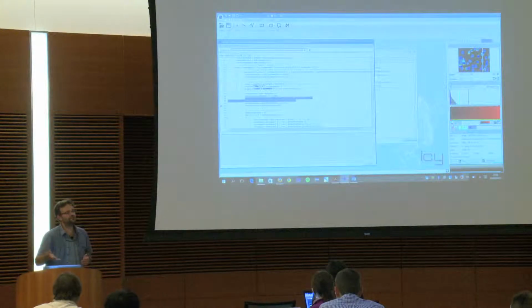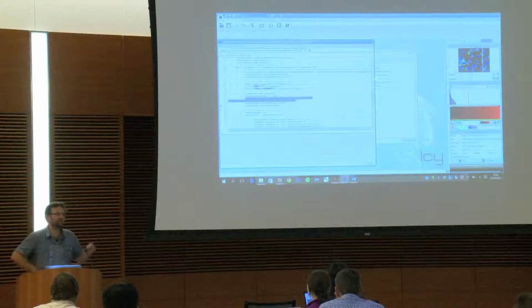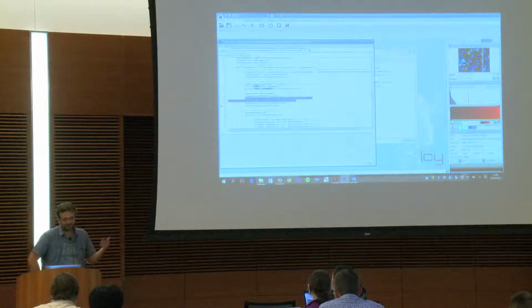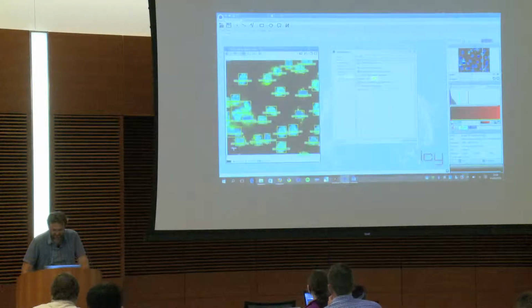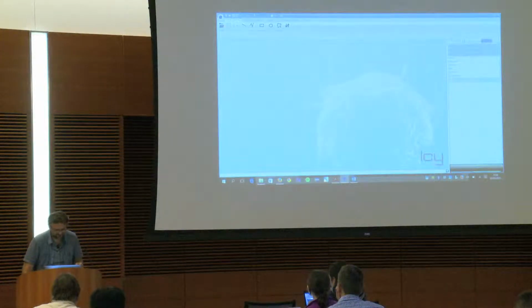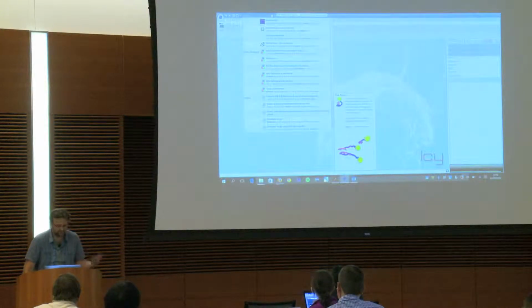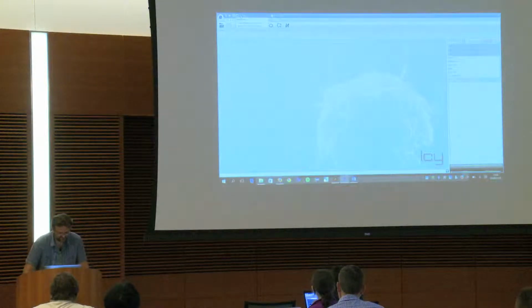Because if you change your GUI on a plugin that is used a lot, and sometimes people ask you to change default parameters, then you are facing a problem. So it was a problem in Icy, and that's why, even instead of using the script, Alexandre Dufour, who is in our lab, talked about making a graphical interface called the protocol, to create things graphically and without any code. I will show you this.